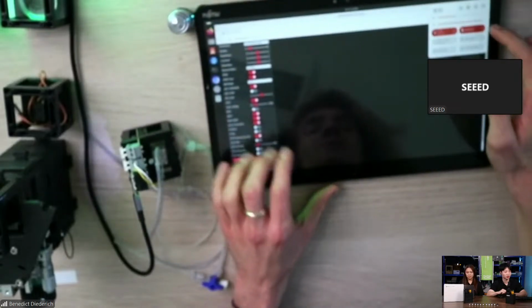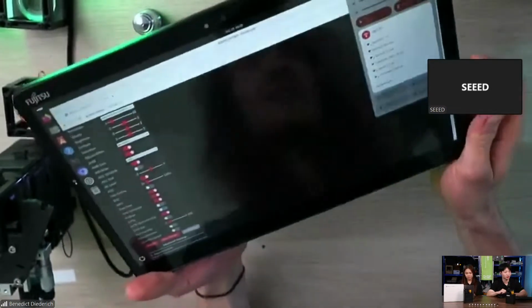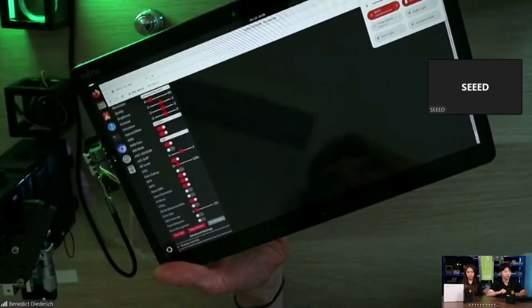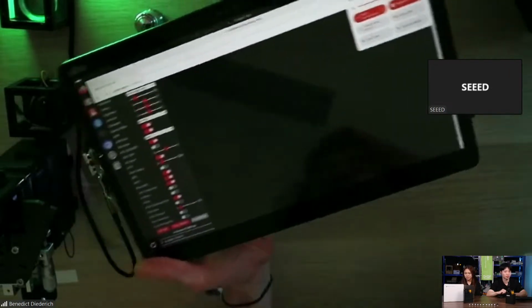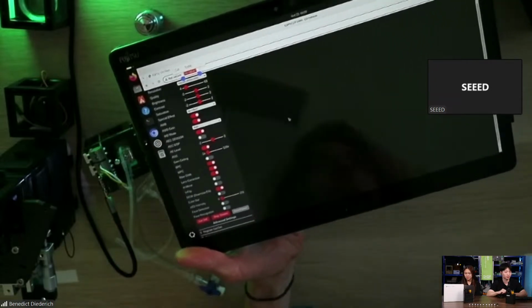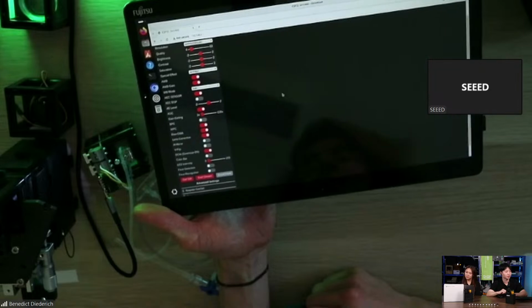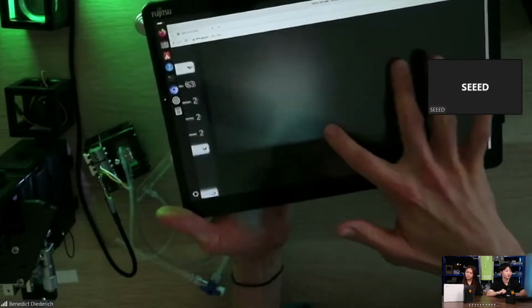What we have to do here is we look for Wi-Fi signals near us. And then you choose the open UC2 Xiao. What it's doing, the Xiao microscope here is essentially just hosting a web server, and then you just connect to that, and then you enter this address in the URL section. It will connect, and what you see here is the ordinary firmware that you probably know from the Xiao Sense camera already. This is the one that's shipping open source as well. And what you see here is the live stream.